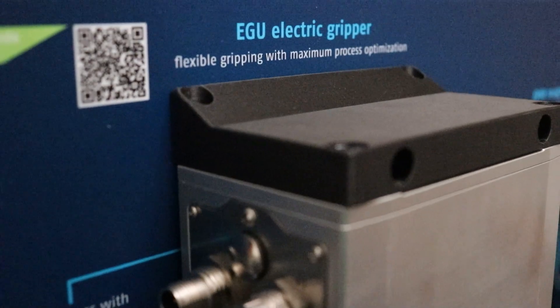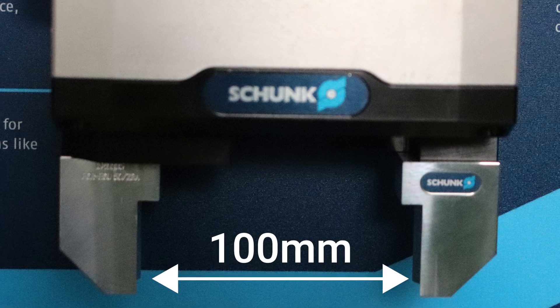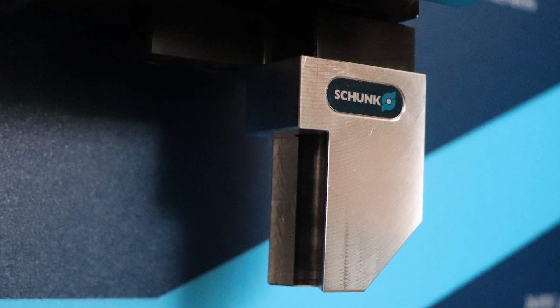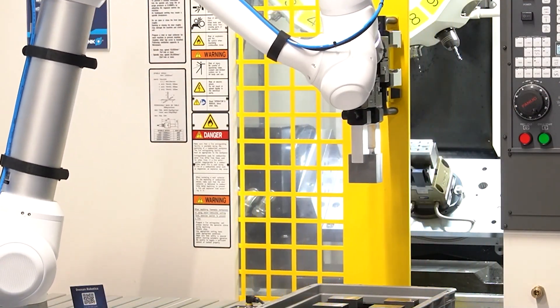This is Shunk's new EGU electric servo gripper. This gripper has over a hundred millimeters of stroke, making it useful for many jobs with just one end effector. It lends itself very nicely to machine tending and heavy-duty applications.